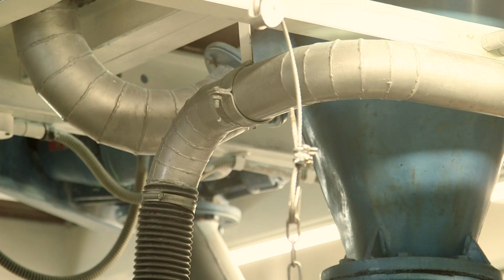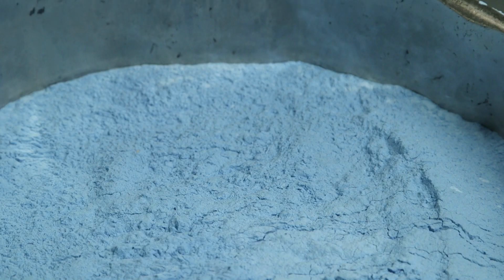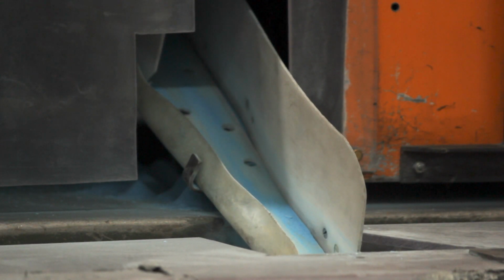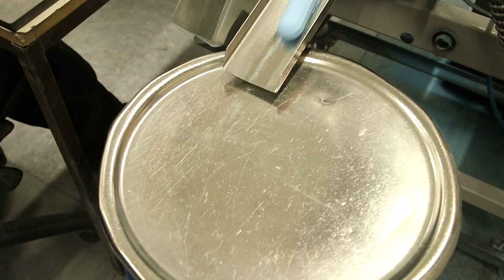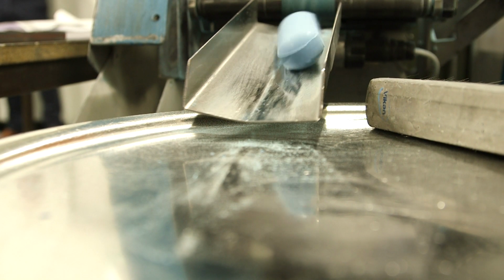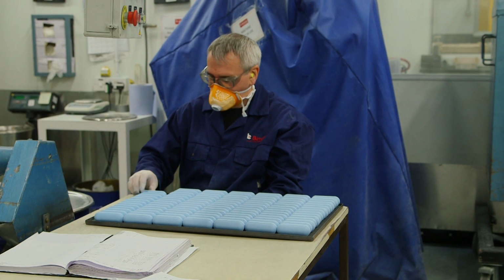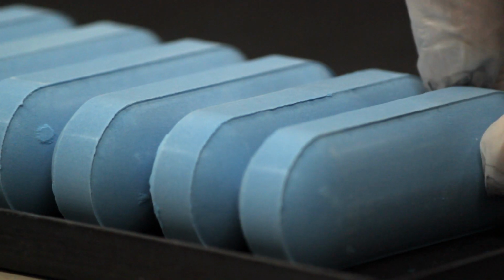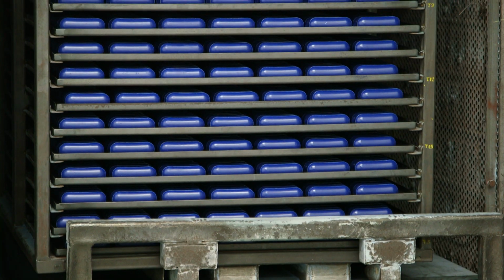The sintering plant is a temperature and humidity controlled environment in which the glass is converted into boluses. This involves milling and sieving the glass to a particular particle size, mixing and binding other trace elements which cannot withstand the melter temperatures, before being granulated, pressed and sintered within a kiln.